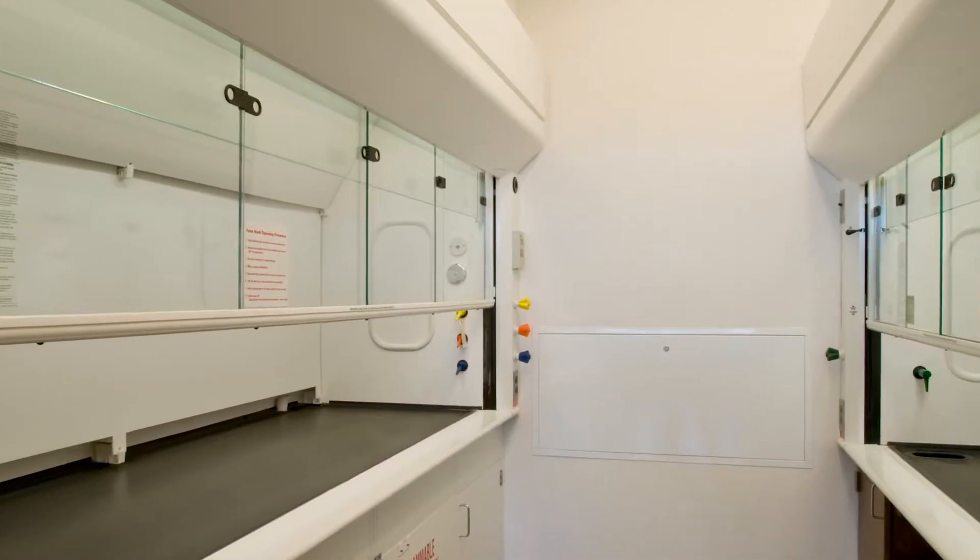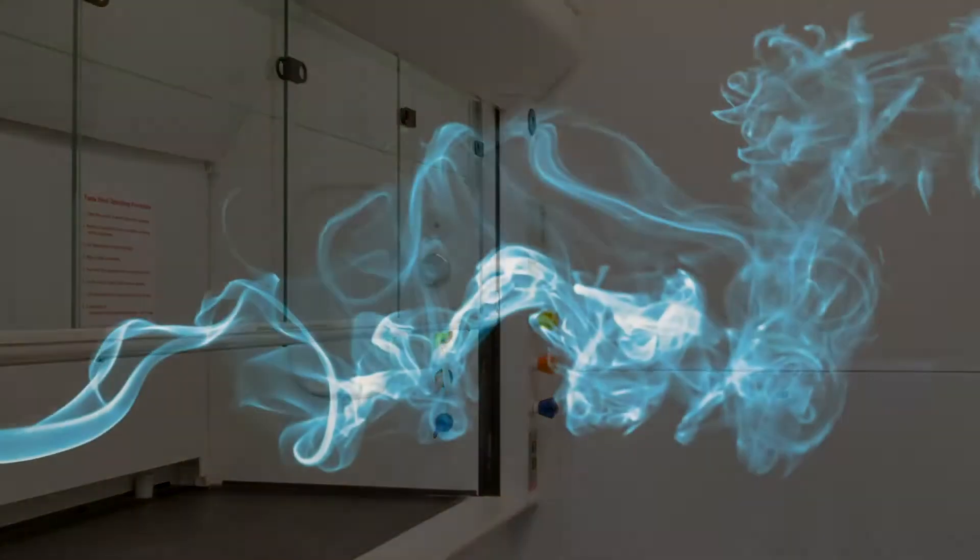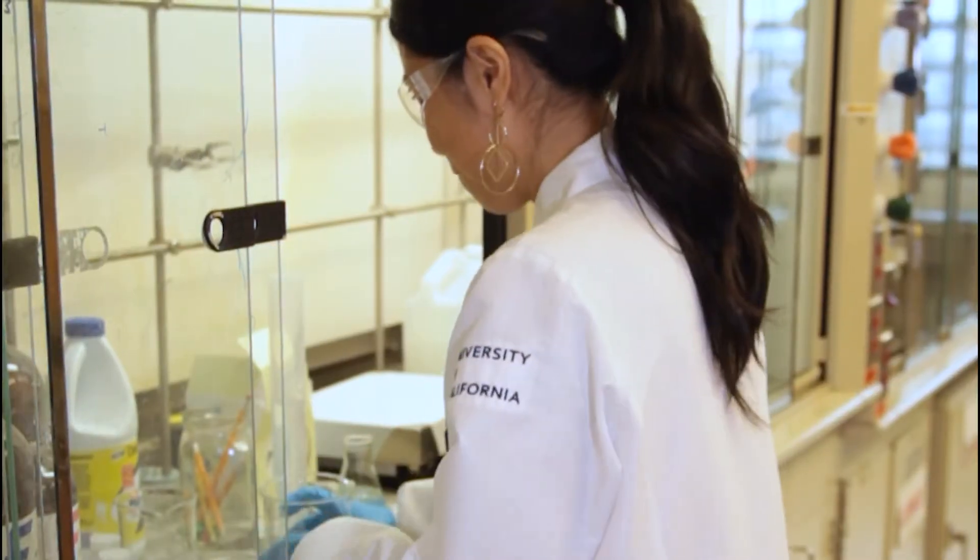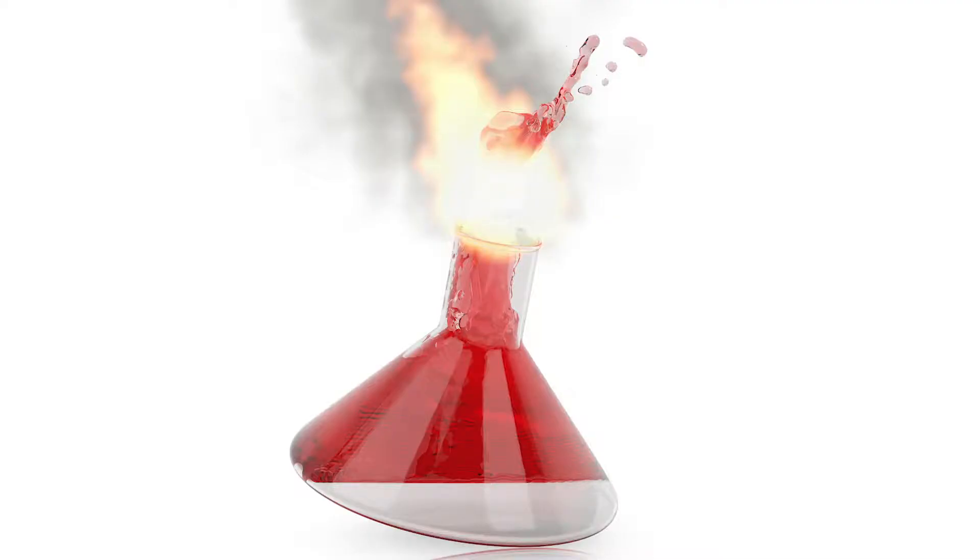Laboratory fume hoods have several important safety functions including capturing, containing and exhausting hazardous fumes, chemicals and radioactive materials, protecting users from splashes, fires, minor explosions and exothermic reactions.